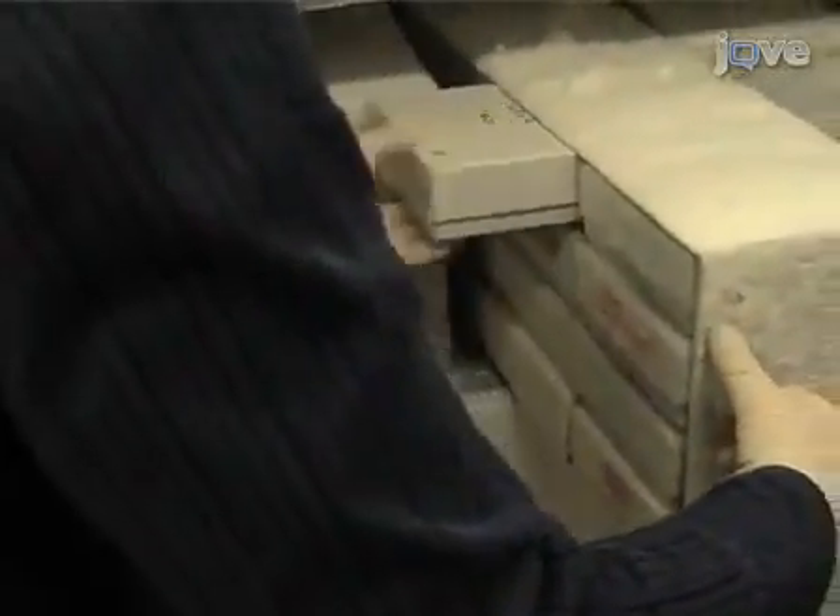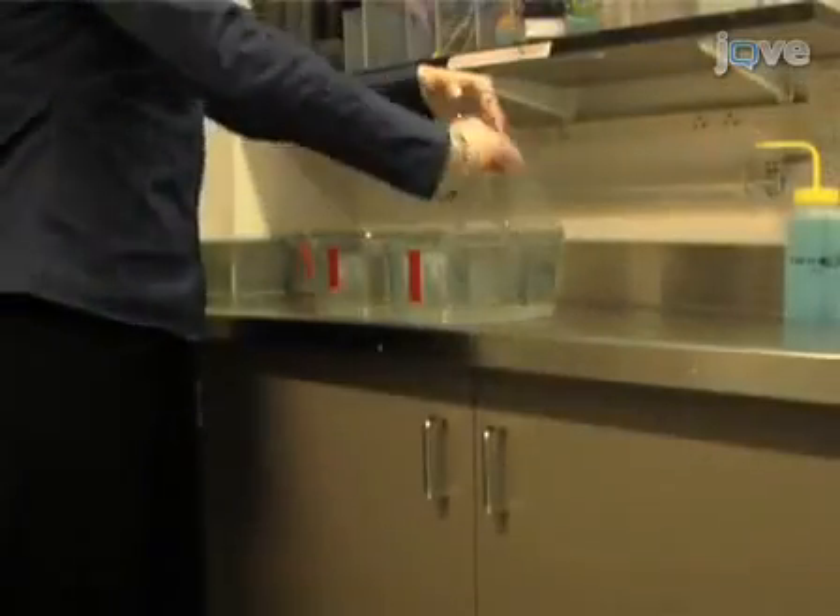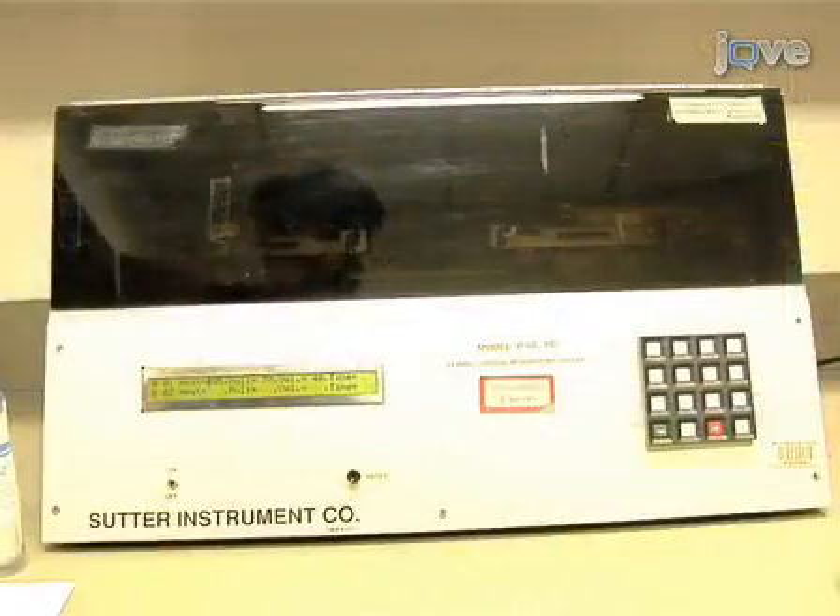On the day before injection, set up mating cages separating the males from the females. On the day of injection, use a Sutter Instrument micropipette puller to pull capillary needles for injection.